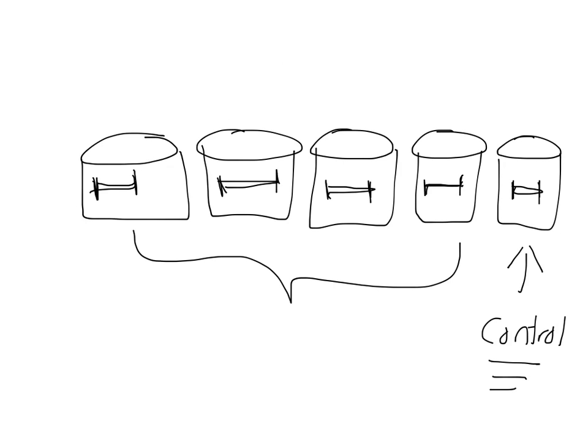Don't forget to weigh before and after. And then think about why that would be important. Why would you need to know the weight before and after? Will your bag be heavier, lighter, or the same? Why? So these are some of the questions that you should think about.